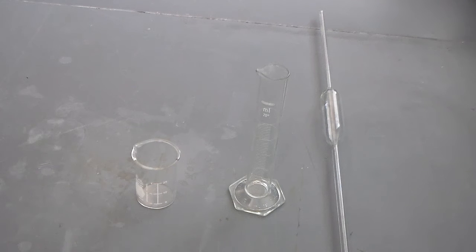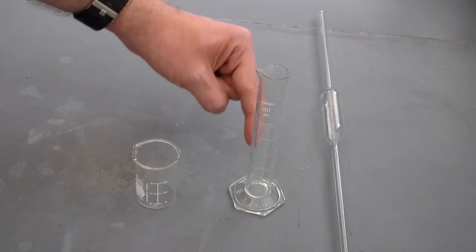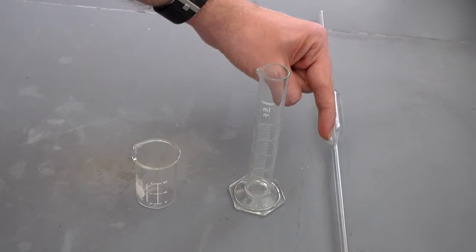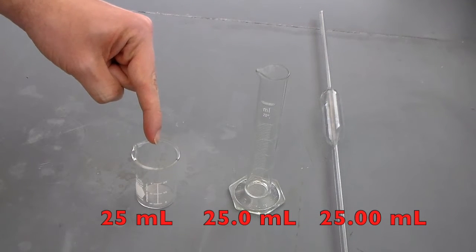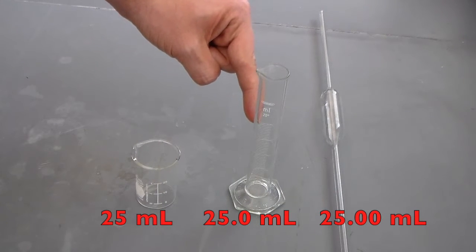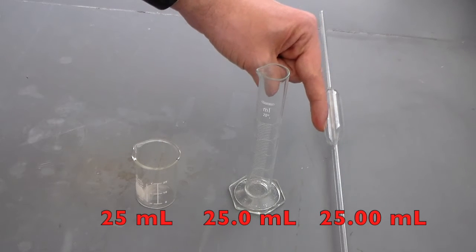Here we have three ways of measuring out 25 milliliters of liquid. The 25 milliliter beaker, the 25 milliliter graduated cylinder, and the 25 milliliter volumetric pipette. The difference between these is the beaker will measure 25 milliliters, the graduated cylinder will measure to 25.0 milliliters, and the volumetric pipette will measure to 25.00 milliliters.